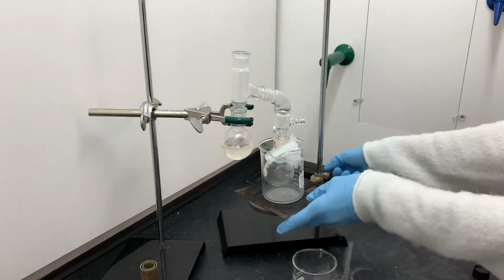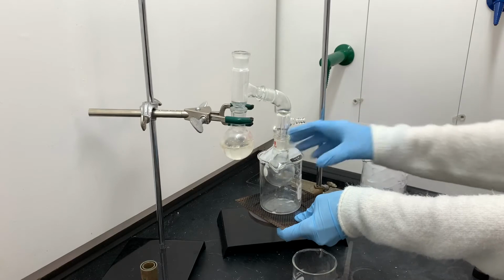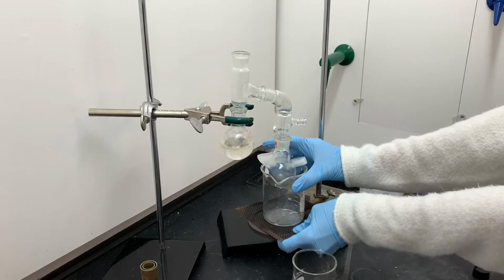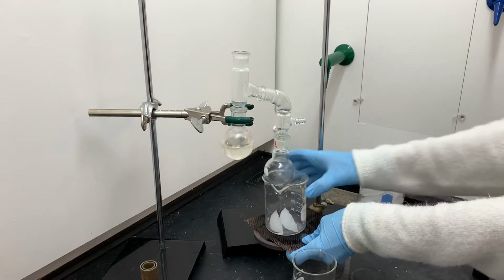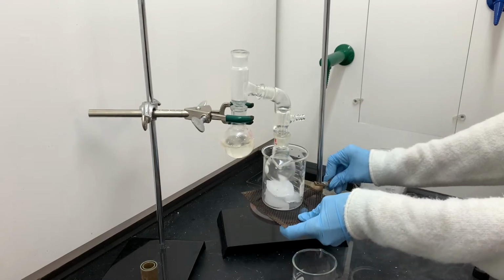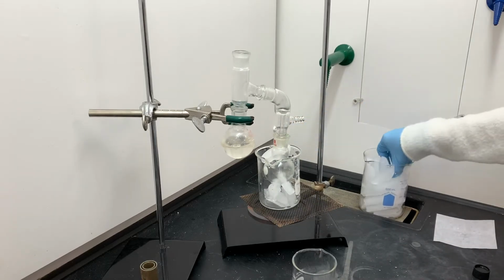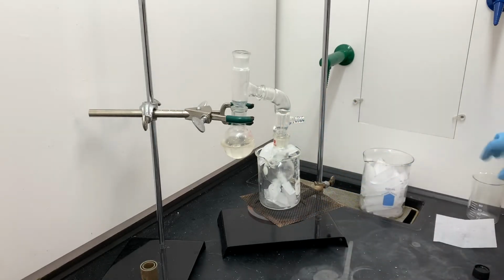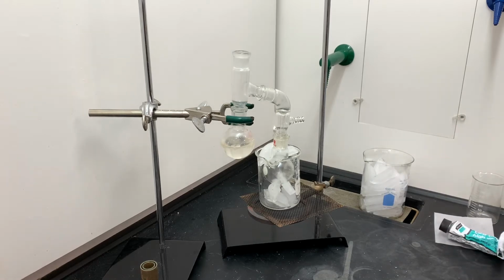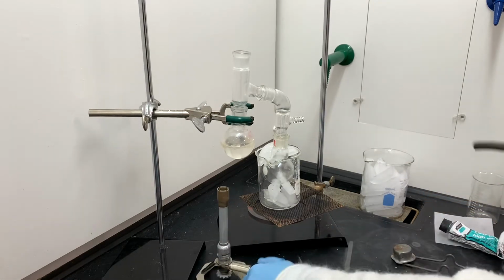And again, notice that nothing is being held together with Keck clips, which makes this reaction a little bit more stressful, because the grease that is used to hold the joints together is not sticky, so it's not really connecting and securing the glassware. Right now it's just all kind of dangling. So as this reaction goes along, I'm going to be monitoring it more than normal to make sure that the glassware is not slipping apart from itself. Now that top I just pointed at is open. I am going to cover it up with some foil to help minimize the amount of stuff that escapes during this reaction. So now everything is ready.